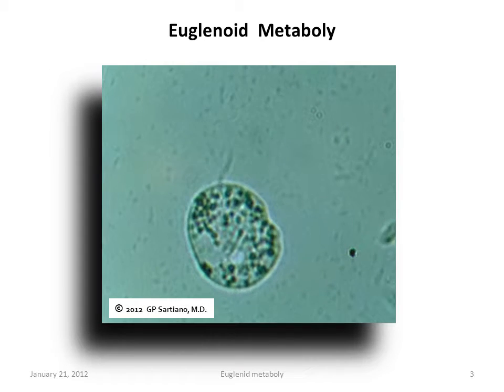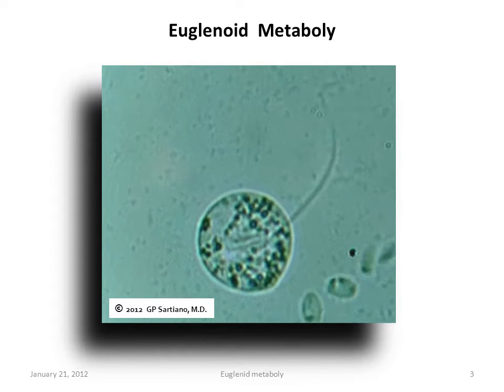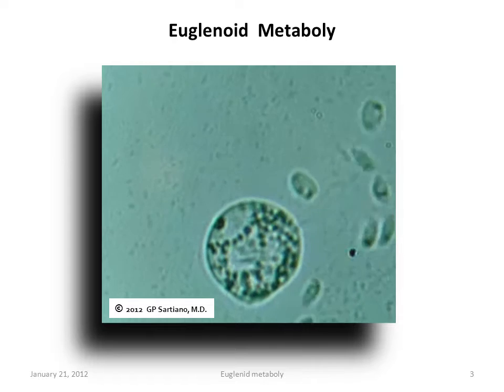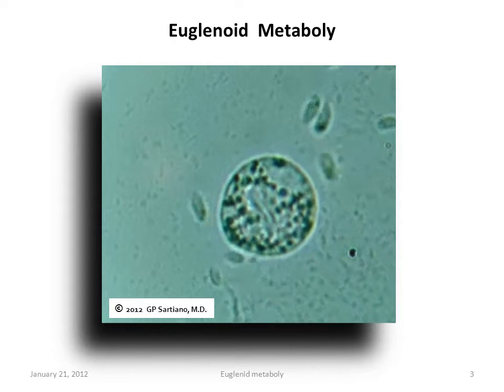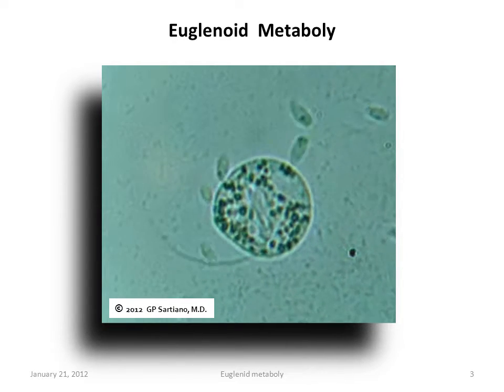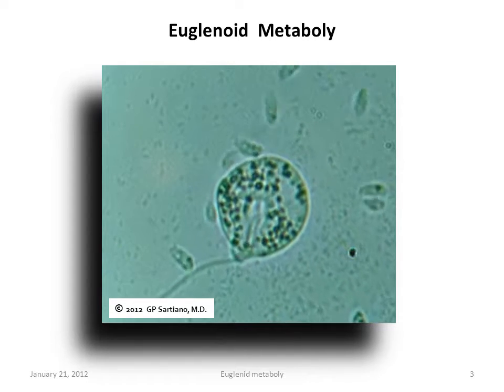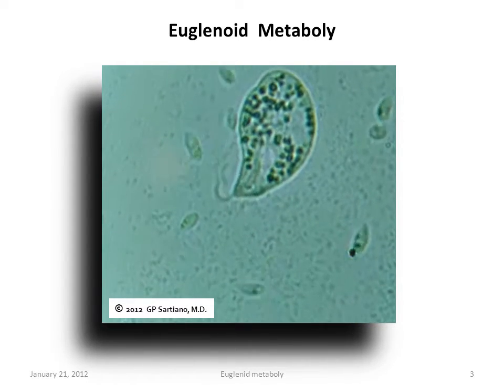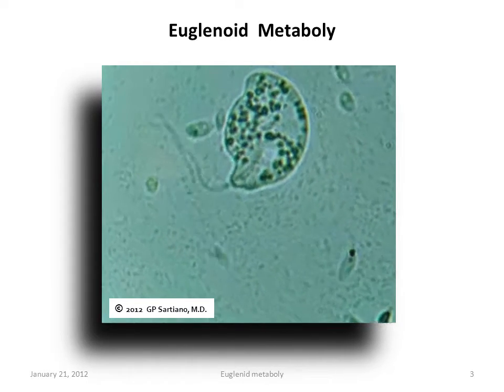Note that in this example, the organism becomes so contracted as to invaginate its anterior end into its body and take on a spherical appearance.